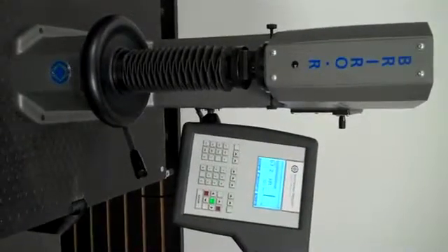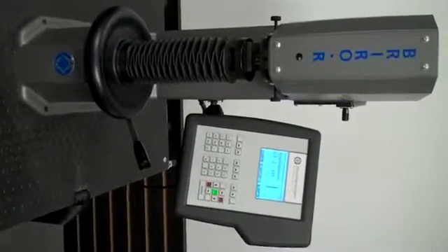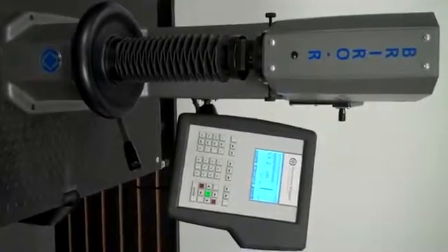Today we're going to talk about the Wilson Briro R Clamping and Standard Rockwell Hardness Tester.